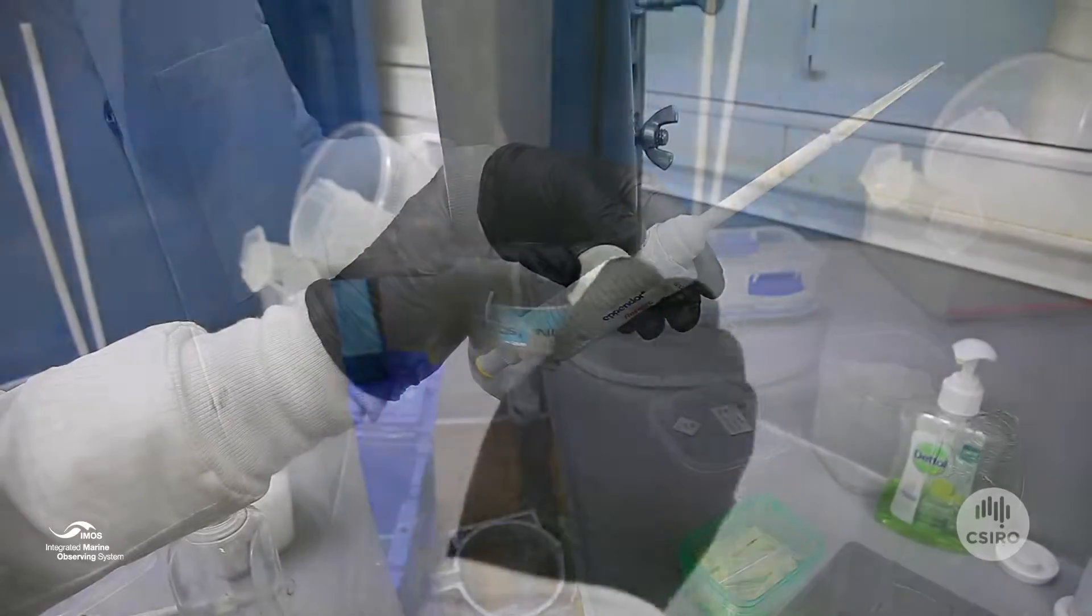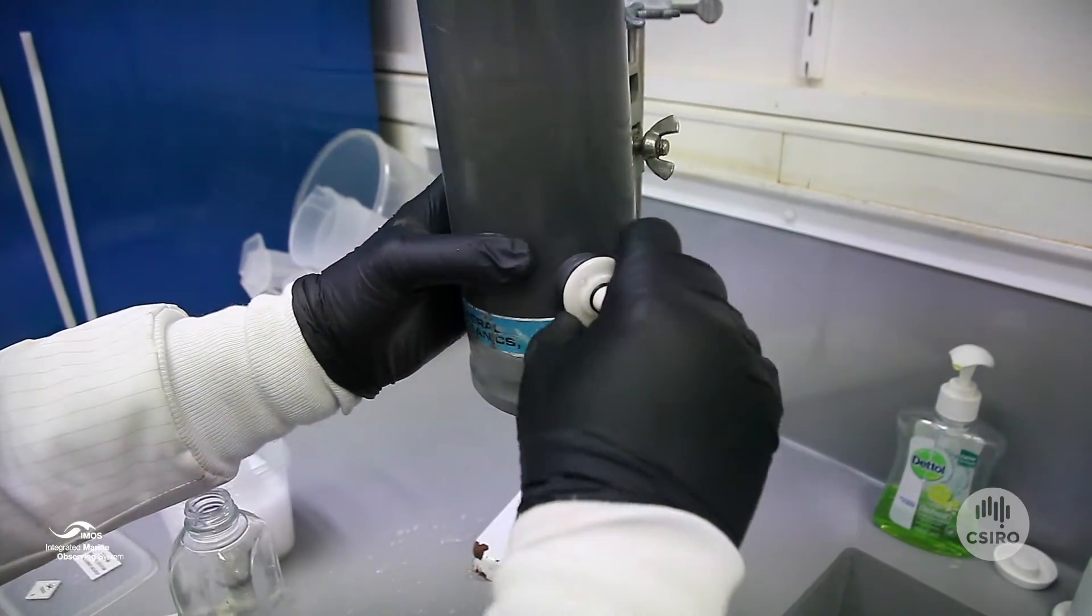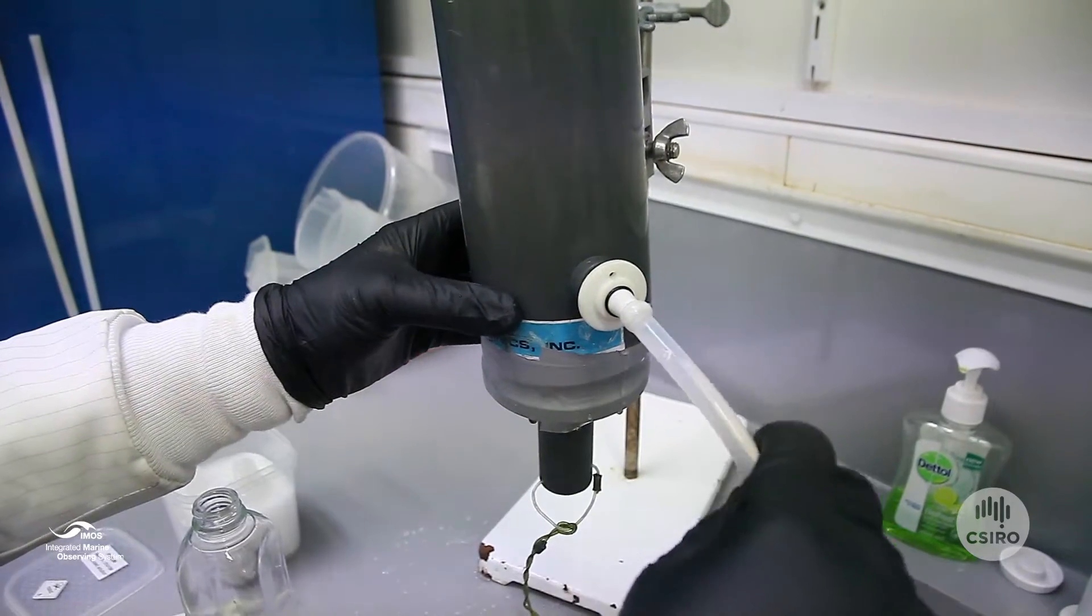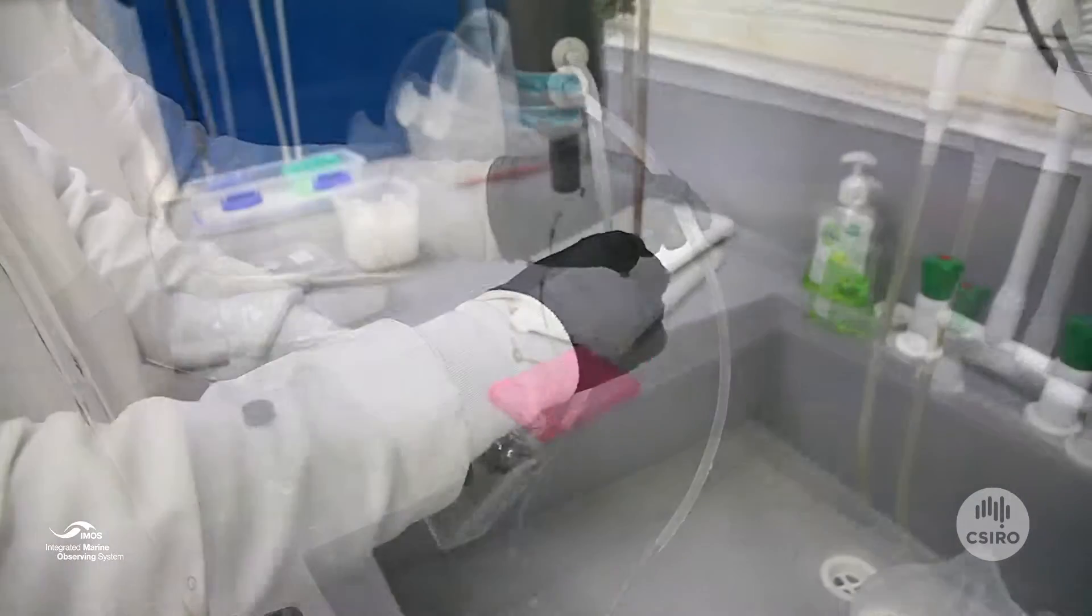Also supplied is a sampling tube. Fit this to the spigot on the Niskin—this can sometimes be quite difficult. Start the flow through the tube.